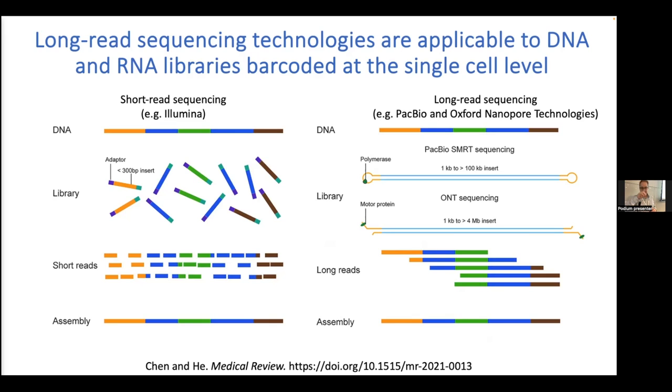Yes? Kind of covered this in the bulk sequencing, but I forget why recommended. Like, why not prime on the entire DNA and then just kind of get the results? It's a problem with the sequencer itself. Every base you read suffers a slight decline in quality. So you start out with perfect quality, then you're 99, then you're 98. And by the time you hit 150, that quality has really fallen off the cliff. So it's a problem with Illumina sequencing and other short read methods specifically, whereas Nanopore will just go until you hit the end, essentially.